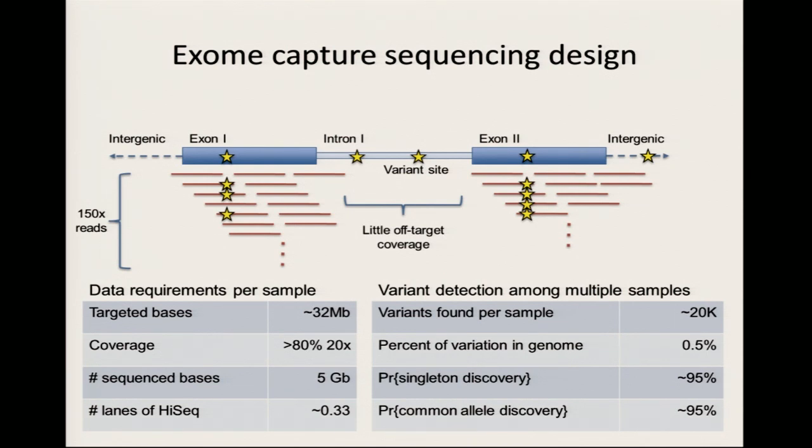And so what it looks like is in the middle, there were real variants like in the intron and all this other stuff, but you just have nothing there at all. It's just blank. It's just a sea of blank. But then when you get to the exon, now you have lots of coverage. So your ability to genotype in those areas is great. You just have no ability to call variation off of the targeted region. That's the basic trade-off. Any other questions?